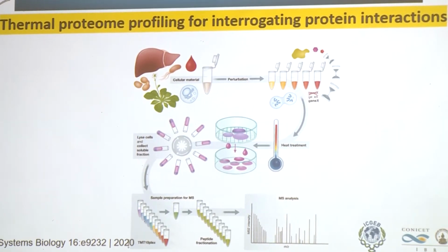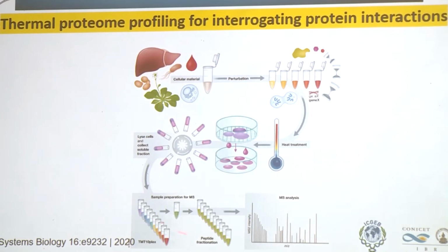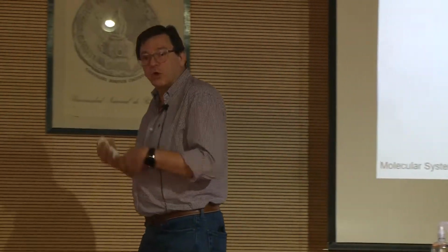Then you get the soluble proteins of a proteome, and you study which are the proteins that survive the thermal challenge that you have put on the proteome.